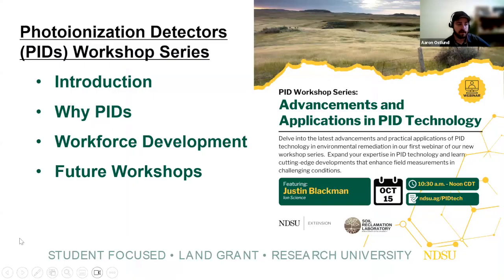And with that, I'm going to give us a quick outline of what we're talking about here today with the PID Workshop Series on advancements and applications in PID technology. And so we're going to do an introduction on what photoionization detection is and where that technology is useful in the remediation and reclamation of contaminated soils.